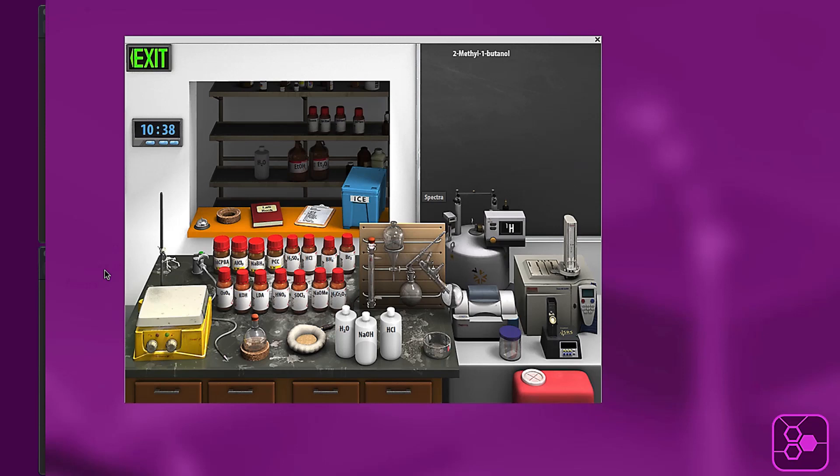So for today's tutorial I am using activity 2-13 hydroboration. I have already done the reaction and worked up my product. Down here in this flask on the bench I have 2-methyl-1-butanol which is the desired product for this reaction.